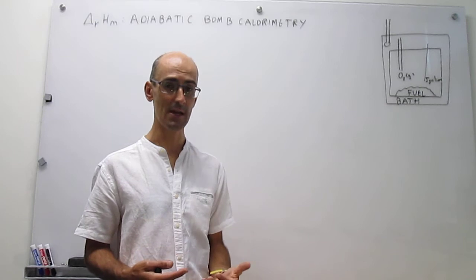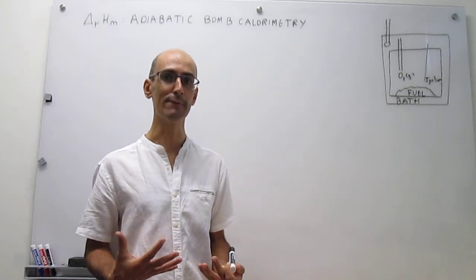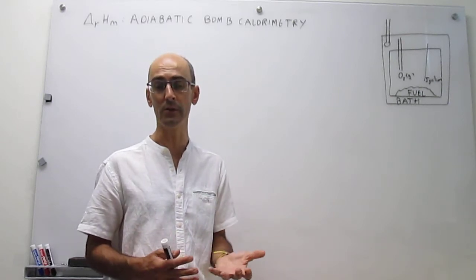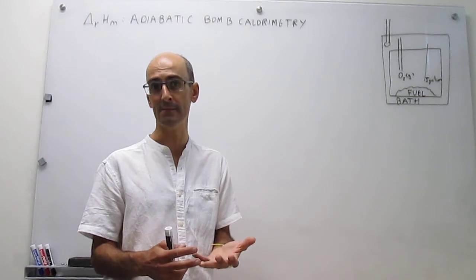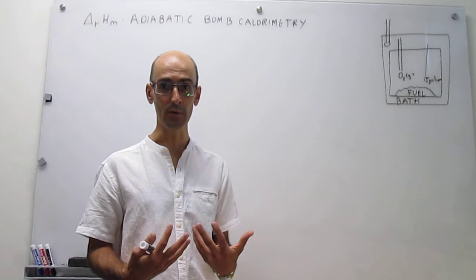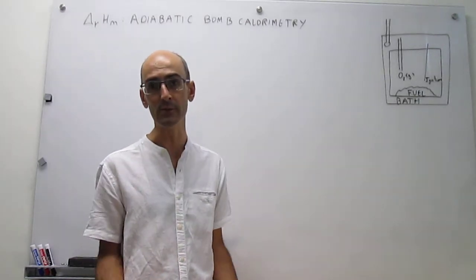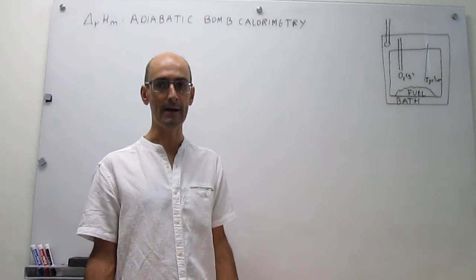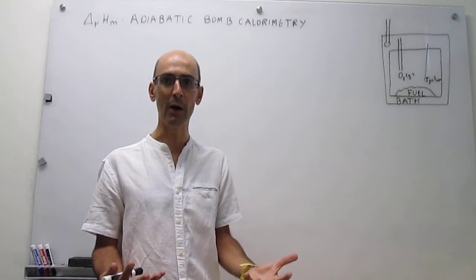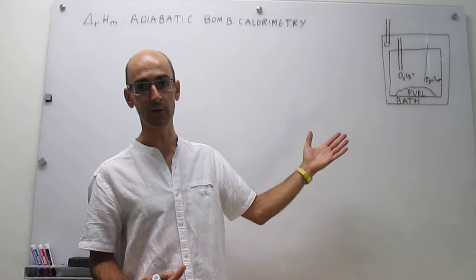combustion reactions. And combustion reactions are extremely important because our body is fully powered by the combustion of carbohydrate, glucose, and fat, and a little bit of protein, right? All those are combustions, right? So knowing what the enthalpies of those reactions are, perhaps by using bomb calorimetry, will be very useful. And to some extent, the way that we power our world is still through fossil fuel combustion, right? So the same thing could actually be done here.